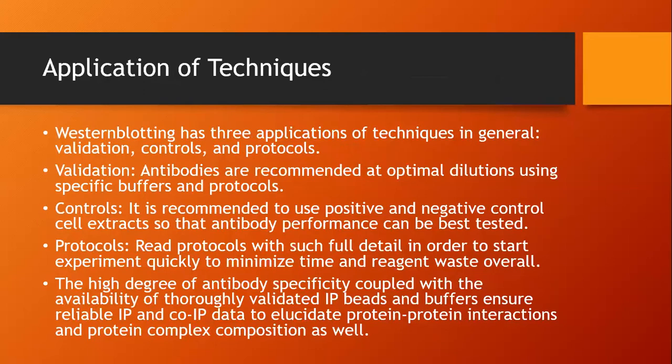For the application of the immunoblotting technique, I divided it into three general parts: the validation, the controls, and the protocols. Let's start with the validation first. For immunoblotting, antibodies are recommended at optimal dilutions using specific buffers and protocols. It's pretty important to do such steps.